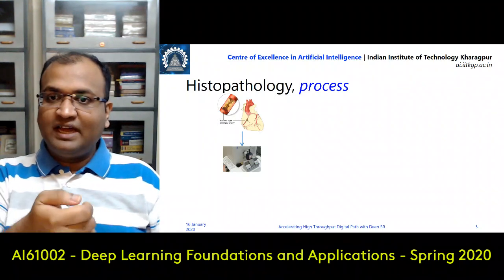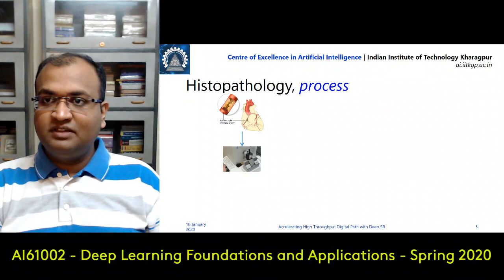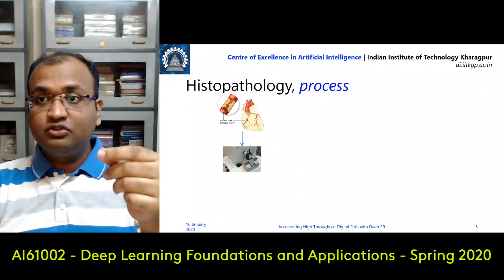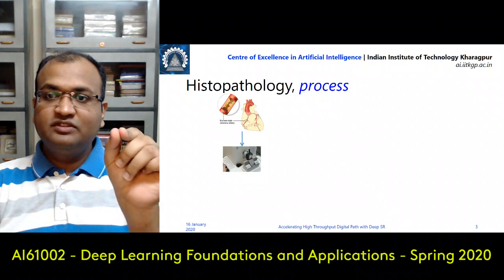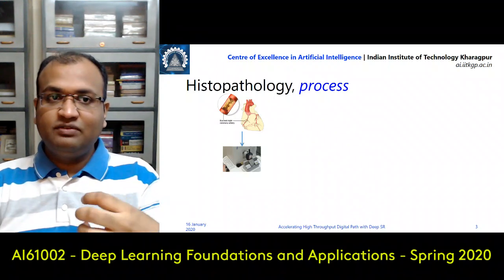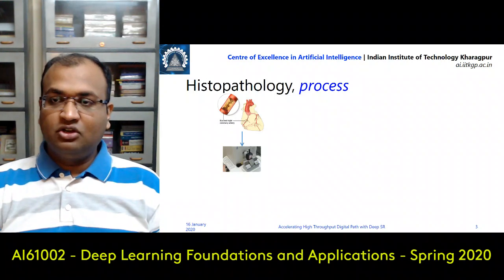if you light a candle and then blow it off, you would see that after it cools down, the wick of the candle also becomes pretty hard. It does not remain soft, and that's because the wax which goes inside has made it hard. So we do the same thing for a tissue, and that fills up these empty spaces inside the tissue and makes it hard. Now that it has hardened up, this really solves a lot of our problems for now.